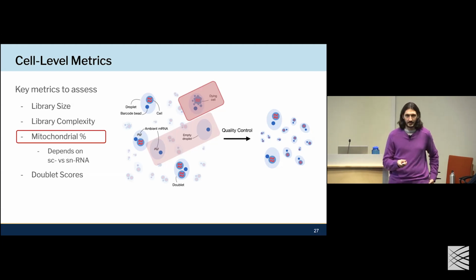And again, it's one of those tools that works very well, but it really requires a lot of control, right? Because if you're too strict with it, you might start to remove true biology. So it's always better to start a little bit more conservative and then bring it up more and more strict as you go.